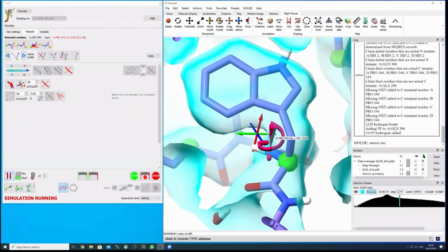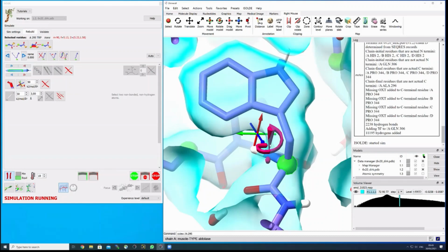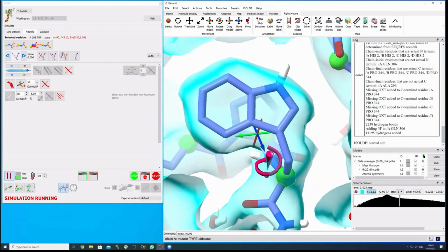And what appears here is a clear rotamer outlier, indicated by this red sign. And this is the perfect example. That was coincidence that this happened. This is a perfect example where the map tells you that this sidechain configuration is correct, although the model validation tells you that this is an outlier. But this outlier is clearly supported by the electron density map or by the EM map, and therefore this is the right way to model this tryptophan. And it was wrong in the model before.